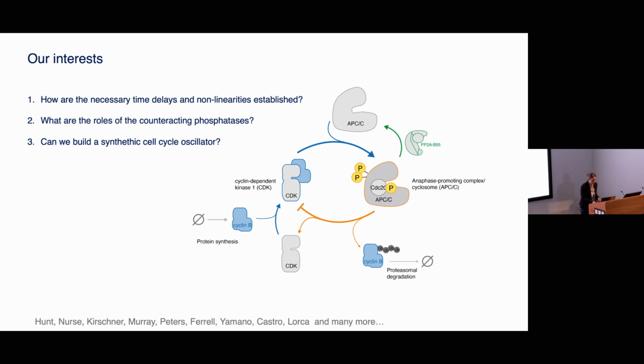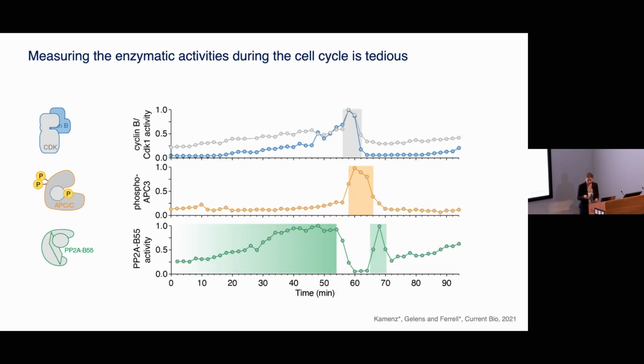And so in the past, this has been very tedious. I actually show you here data from my postdoc, where I took one of these cycling extracts, and I took a sample every 2 minutes for like 90 minutes. And then I took these samples and I measured the enzymatic activities or the phosphorylation state of certain proteins one by one. That was a lot of fun.